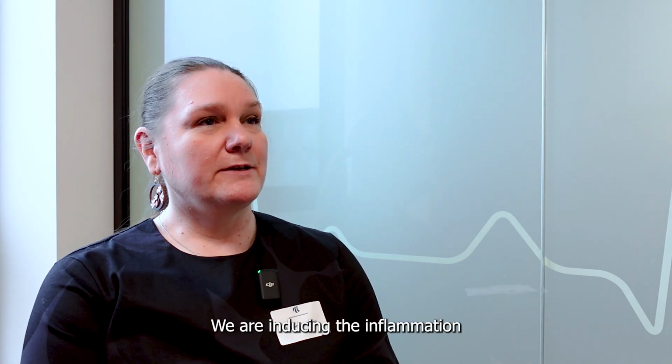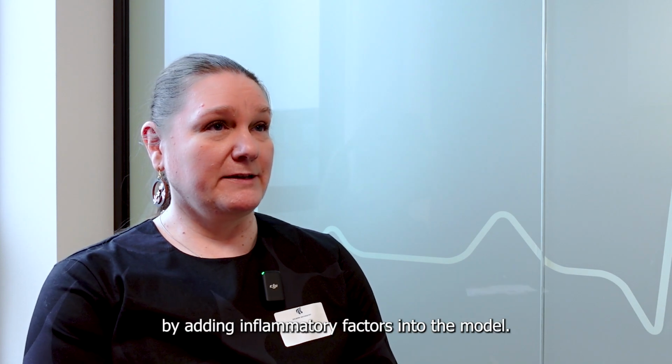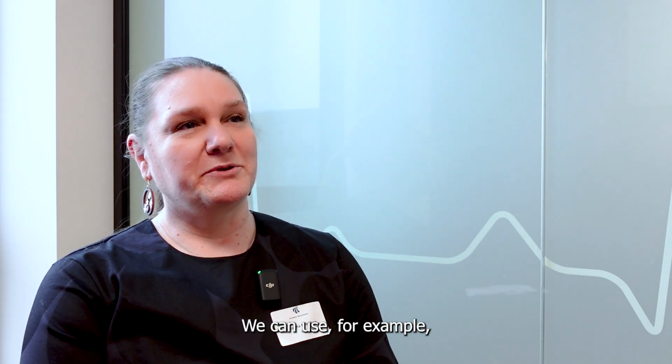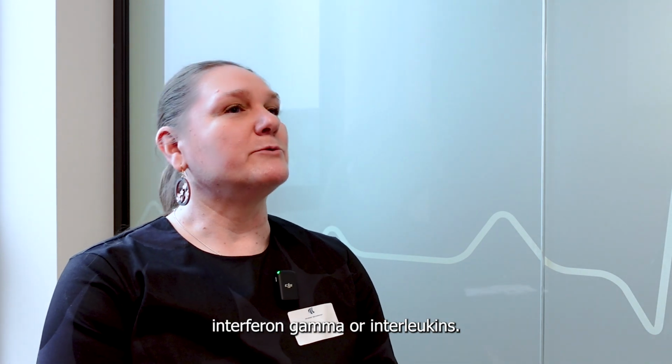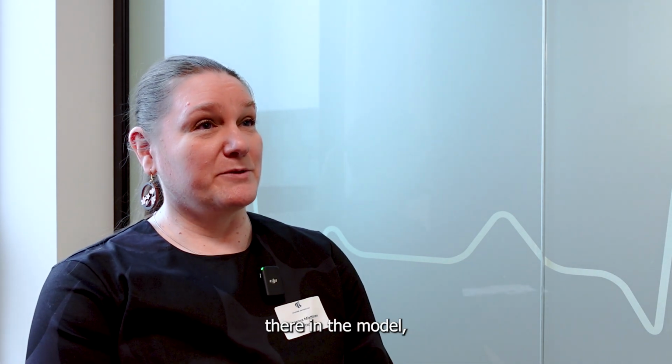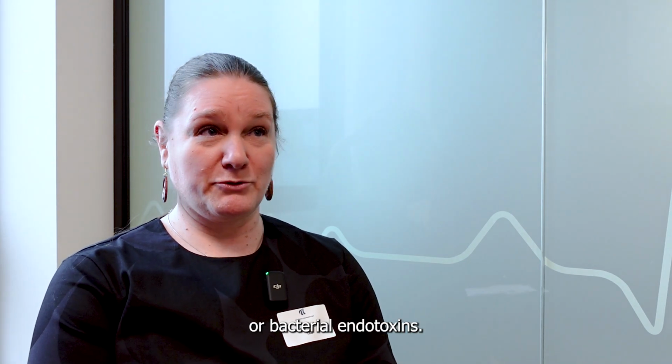We are inducing the inflammation by adding inflammatory factors into the model. We can use, for example, interferon gamma or interleukins. We can also include inflammatory cells there in the model, or bacterial endotoxins.